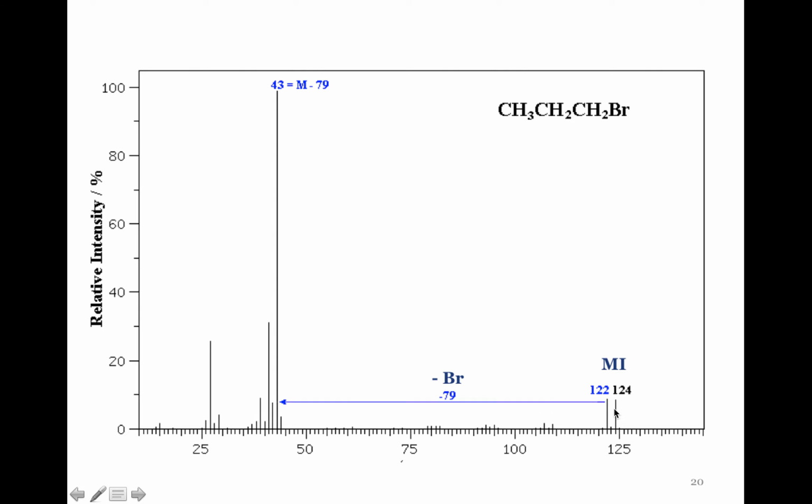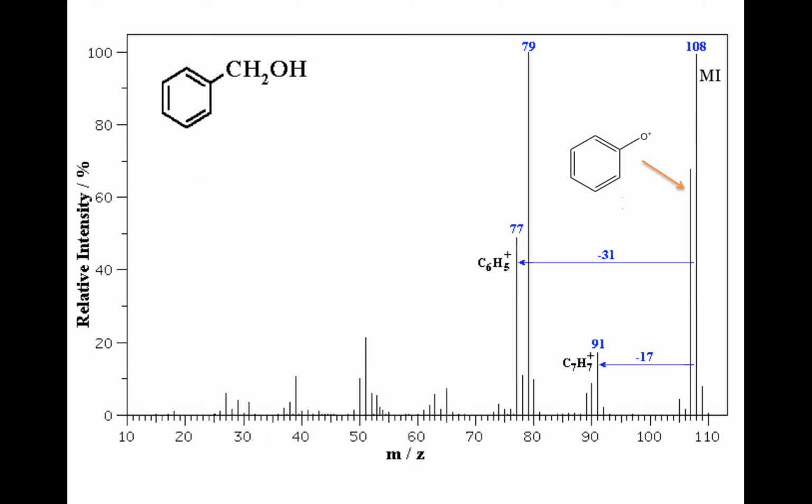And the other thing you can tell, because it's a 1-to-1 ratio, is that it's again bromine. So the resulting 43 represents the propyl group mass. So even with just 2 peaks identified, this is enough. Also, this is the base peak. So that's enough to analyze a spectrum.